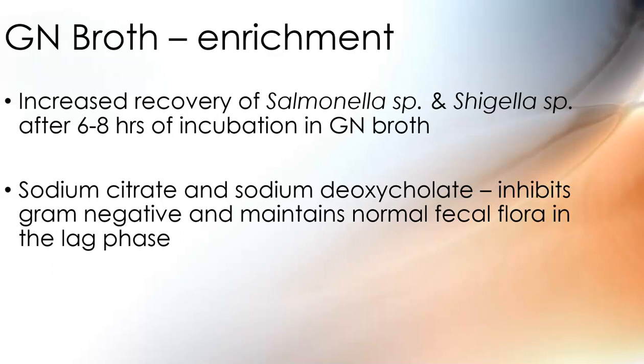GN broth is also an enrichment broth. What do you think of when you see GN? Say it louder. Gram negatives, right? So what we're actually looking for is the most common gram-negative pathogens when we're talking about enteric organisms, and that's Salmonella and Shigella. So we have Salmonella and Shigella agar. There's Salmonella and Shigella enrichment broth. There's also GN broth, and the GN broth also will help to recover Salmonella and Shigella.